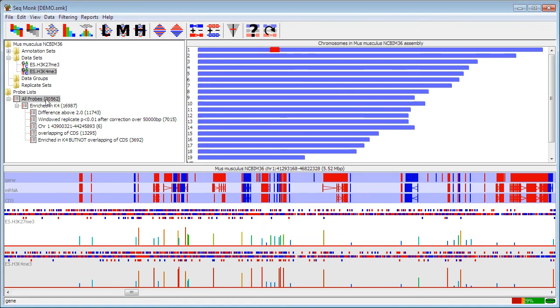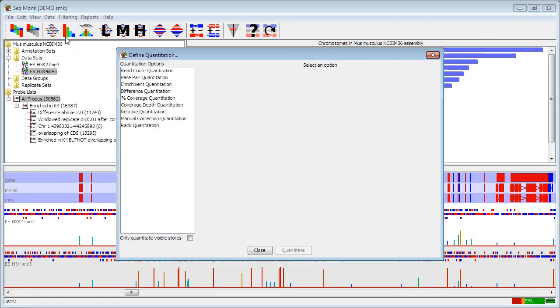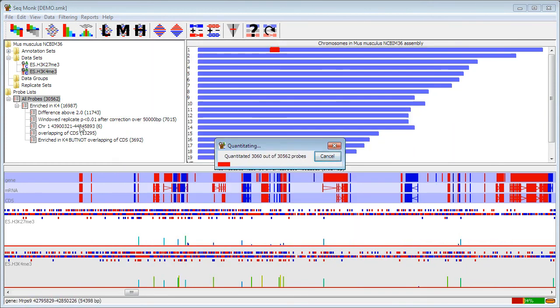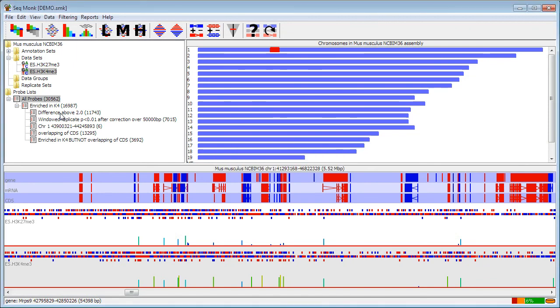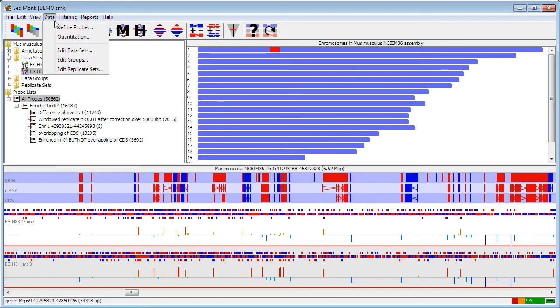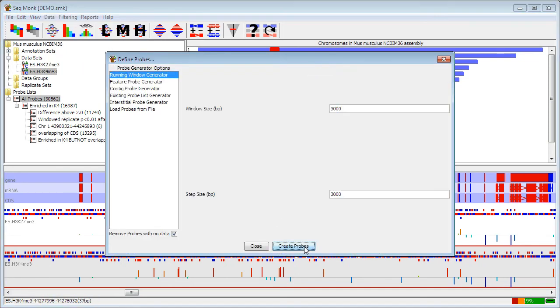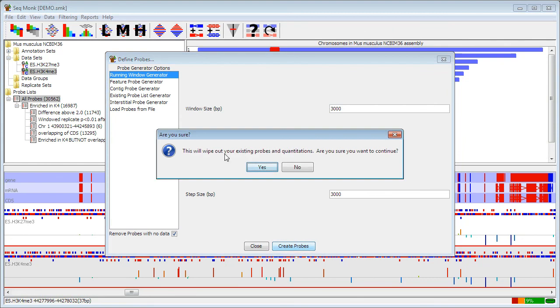If you choose to re-quantitate your data, as long as you're leaving your set of probes being the same, that's no problem. You can re-quantitate and your list of probes on here will not be affected. That's because the list here doesn't apply to the values, it applies to the set of probes, and the set of probes hasn't changed. If, however, you choose to re-define your probes, you will actually get a warning that re-defining your probes will actually wipe out all of the existing quantitation and probe lists that you have made. So you might want to save your project before you go on to do that.